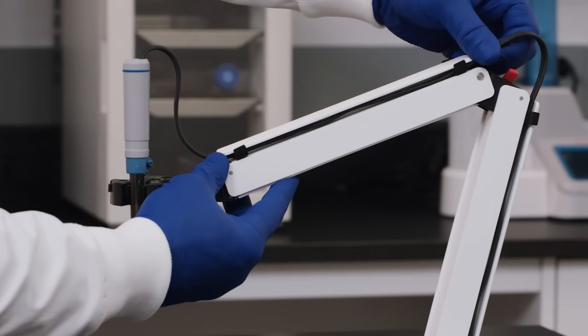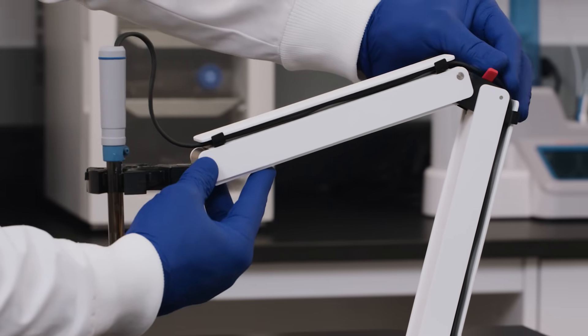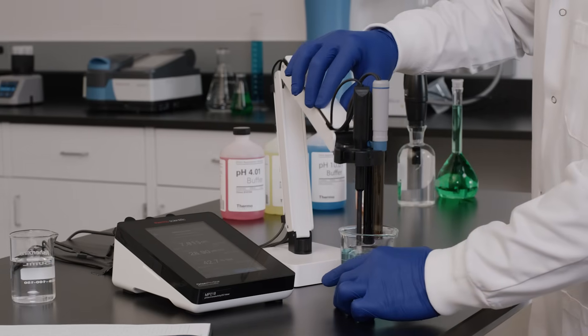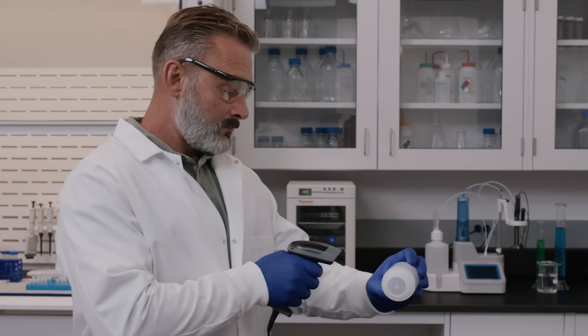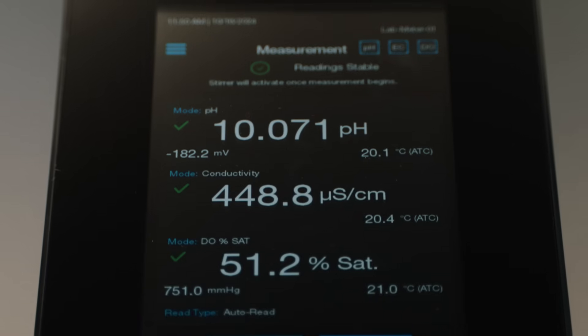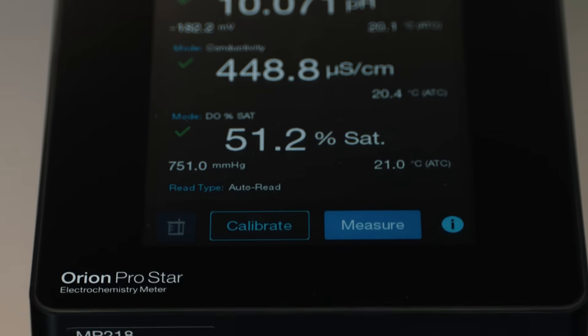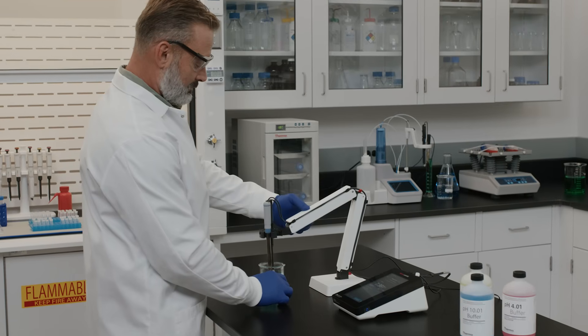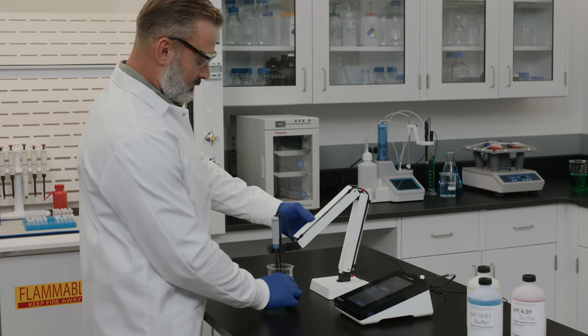Pesky electrode wires are neatly tucked away from your workspace in the freestanding electrode holder. Optional accessories make it easy to log and prepare samples, and the crystal-clear interface displays data to your preferences. The Orion ProStar helps remove uncertainty from your workflow.